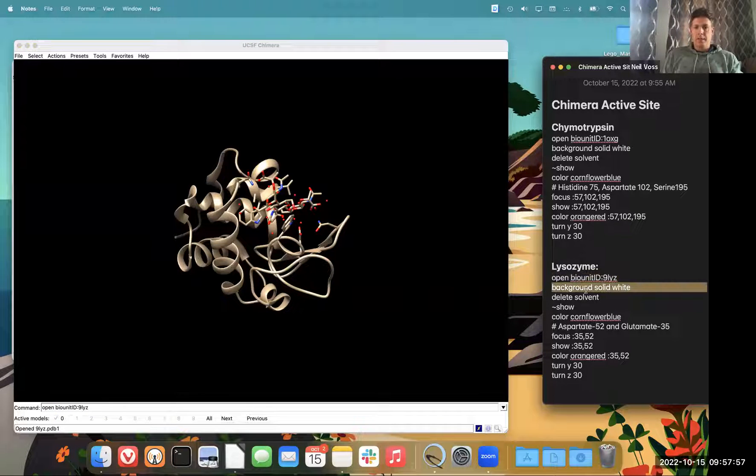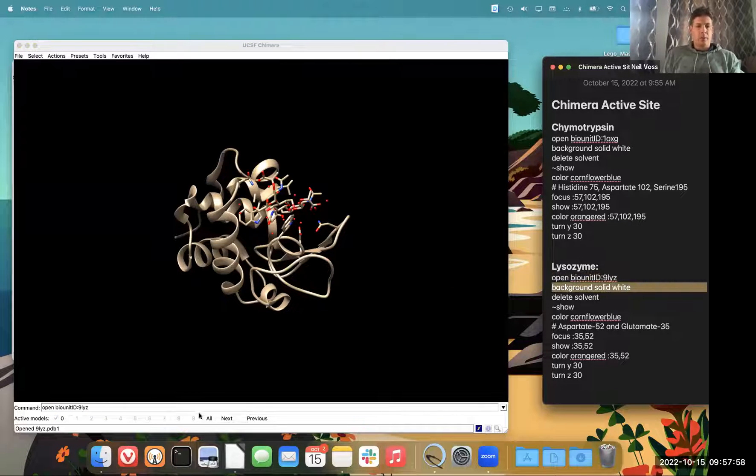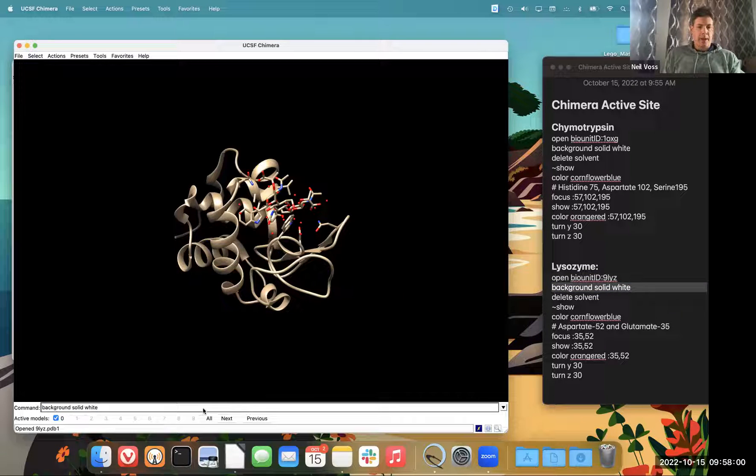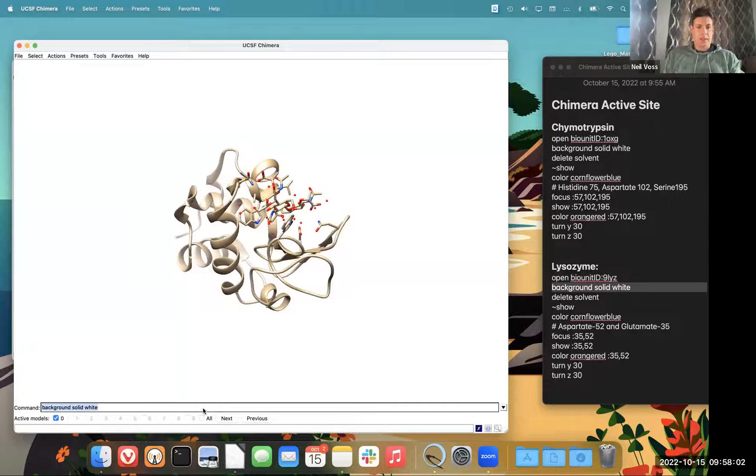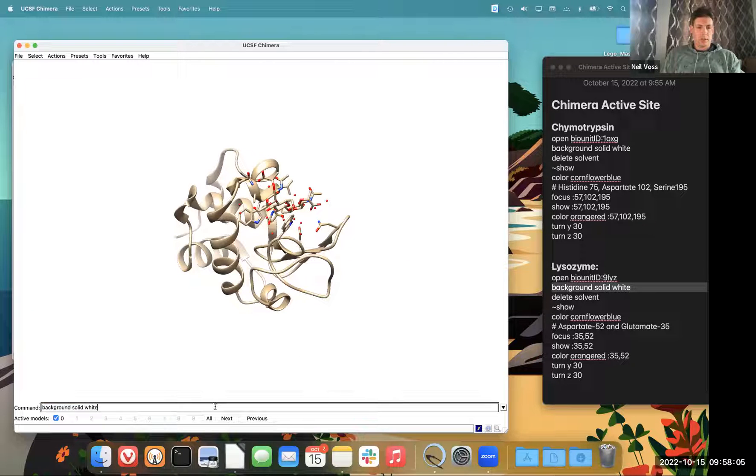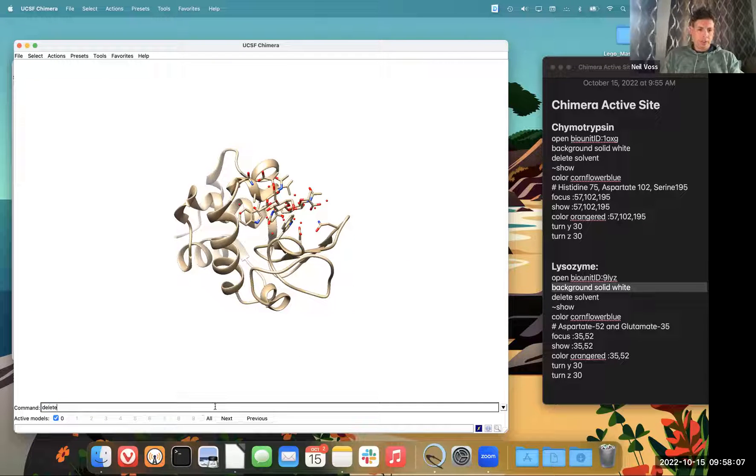So next thing is I love my white background. So I'm going to do background solid white, enter. And then I'm going to delete solvent.